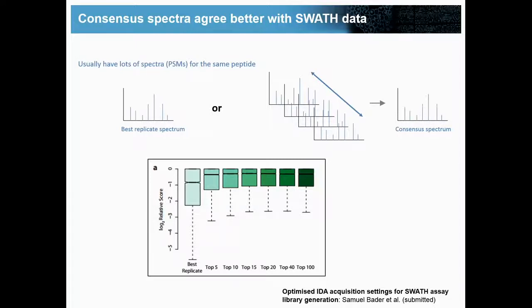But I think this was done in SpectraST, right? Even the best replicate, and I think in this context, best replicate means best search engine score. Okay. No, I don't know. Because there's a published algorithm from BiblioSpec that I know that he has wanted to do comparisons with, but we've changed.